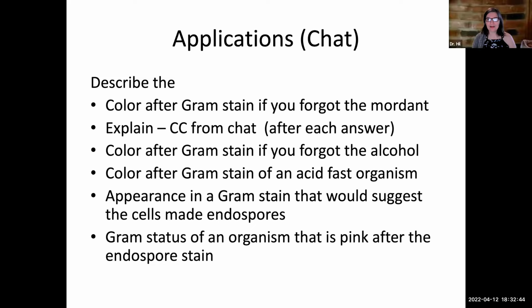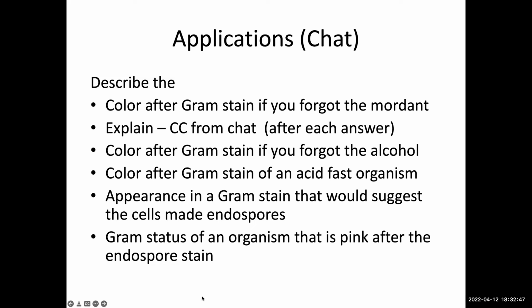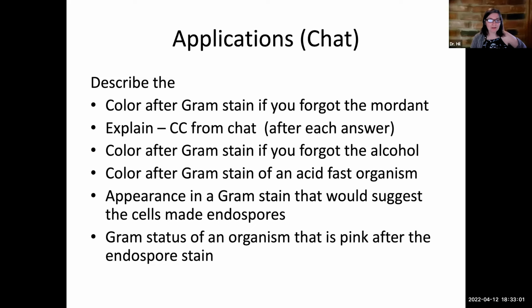Yep. So this question is tricky, right? It is intended to trick you into saying negative, because when you see the word pink and you're asked for gram status, your automatic tendency is to go, oh, it's gram negative, because you know that pink is gram negative. But you have to be careful because this is not a gram stain that was performed. It was an endospore stain. And the pinkness has to do with the fact that there is a safranin step in this procedure that stains things pink always. It's not because they're gram positive or gram negative. They're just stained pink because it's the endospore stain and that's how it works. So it is important to understand that.